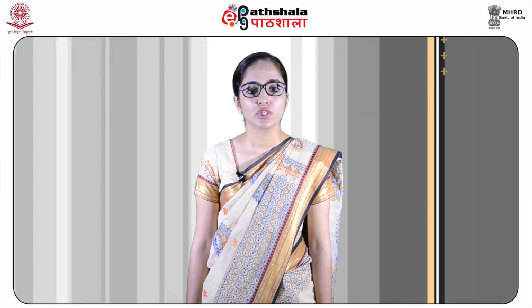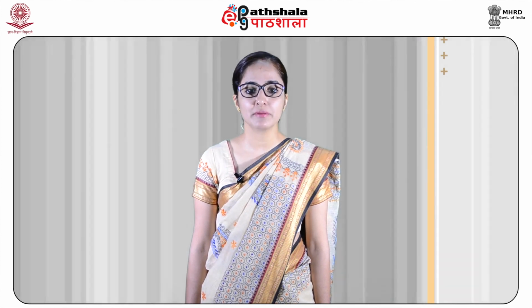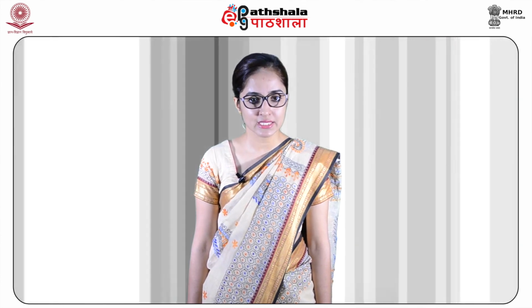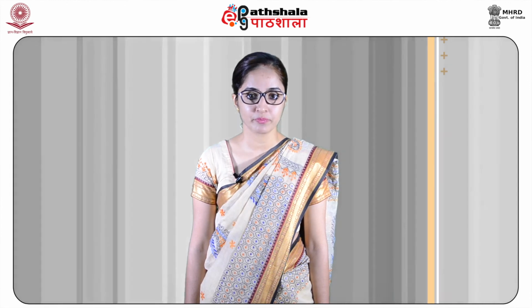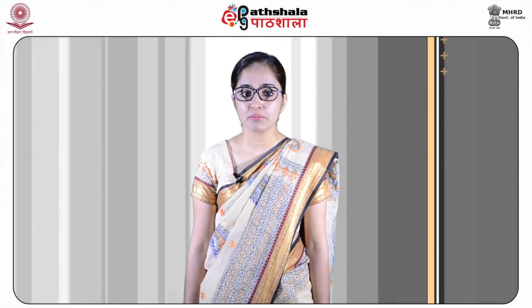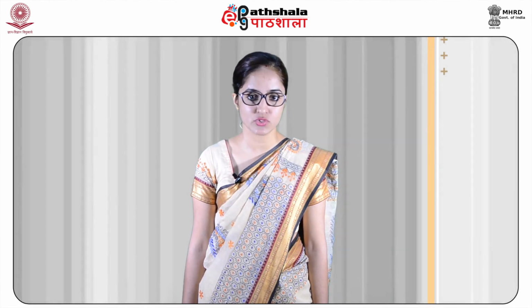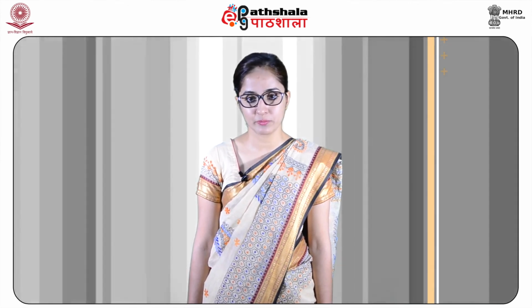Two-dimensional nuclear magnetic resonance spectroscopy is a set of nuclear magnetic resonance spectroscopic techniques in which the data plotted in space is defined by 2 frequency axes rather than 1. Many 2D NMR techniques are there like HETCOR, COSY, eCOSY, NOESY, HMBC, HMQC, ROESY, HSQC, INADEQUATE, TOCSY, etc. These techniques are very useful for detection of various structural aspects of an unknown compound.